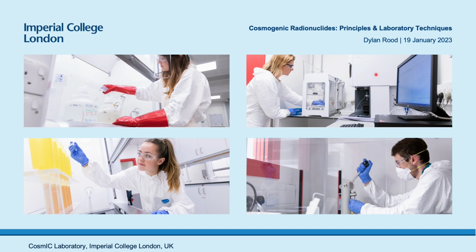We're again using an ICP optical emission spectrometer to do all sorts of testing, both of the quartz and of the fractions all through the chemistry, to track and trace everything we do, to make sure it's of the highest purity and that we're getting all of the beryllium and aluminum out of the sample that we put in.